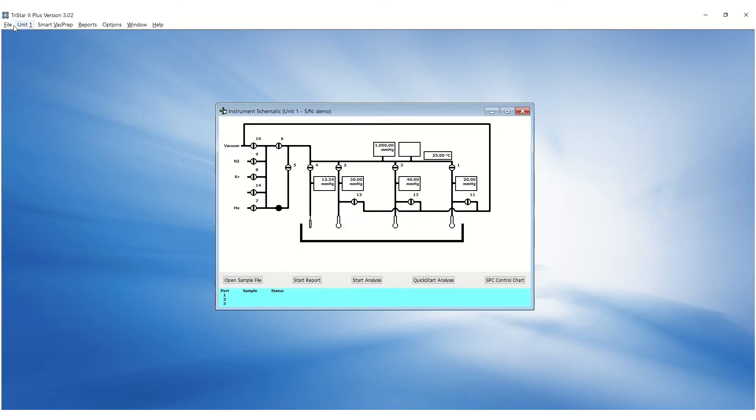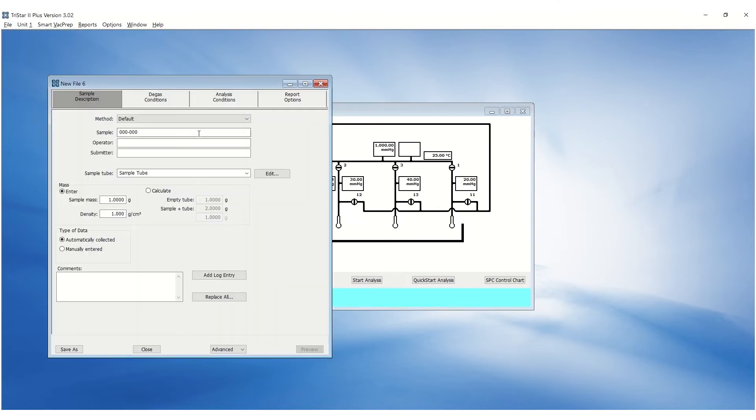In the MicroActive software, go to the File menu and click on New Sample to create a new sample file. Fill out the sample and operator text fields.